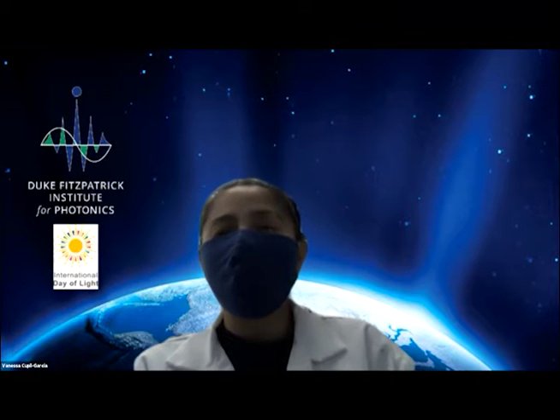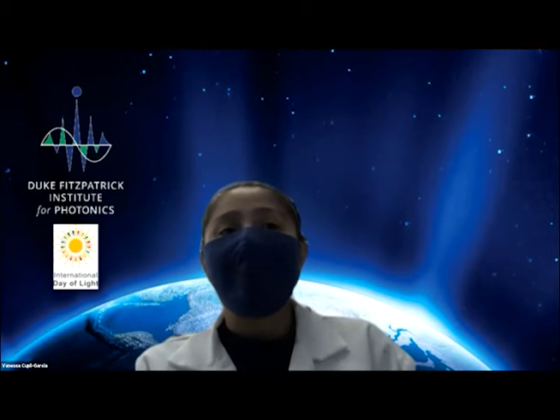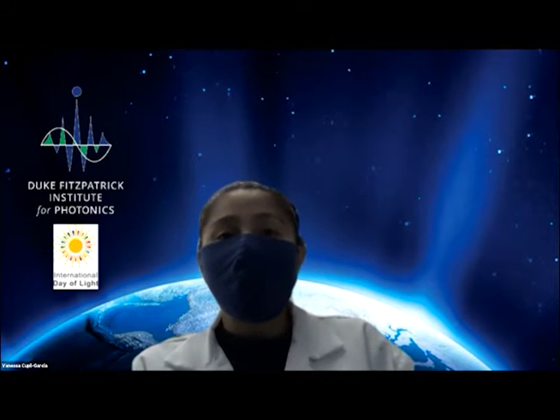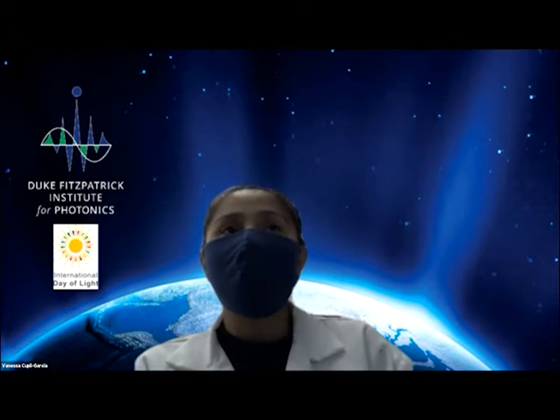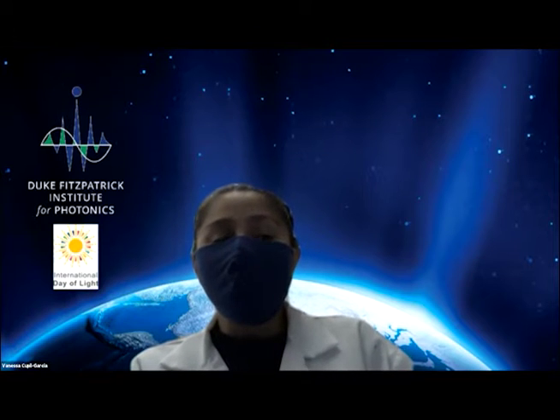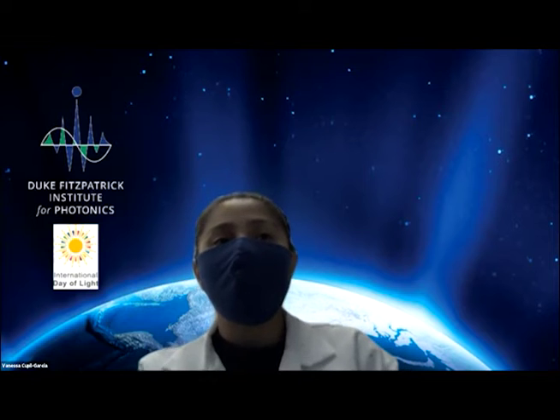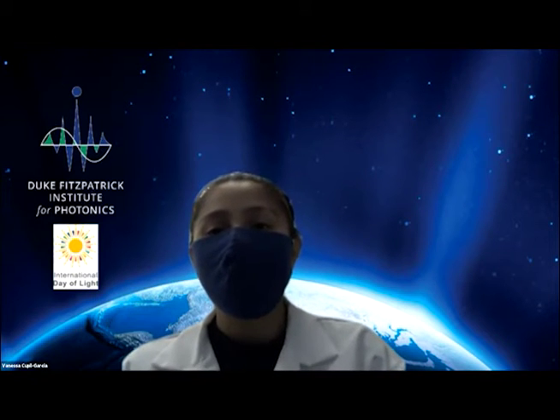In other words, a small capsule of fat. Today I will be walking you through a demonstration using light and scanning electron microscopes using samples that were provided to us by the Boys and Girls Club here in Durham. The middle school students have provided us with a variety of samples and I'll be analyzing three of them today.